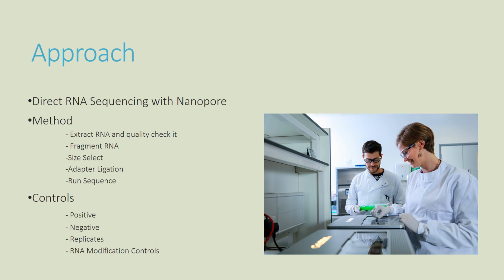Direct RNA sequencing with Nanopore technologies is a sequencing approach that allows RNA molecules to pass through a nanopore sensor. In this technique, the RNA is run through a pore and an ion current is produced based on what nucleotide is being read. Then it is converted into an RNA nucleotide sequence, and each read includes exons, UTRs, nucleotide modifications, and end modifications.